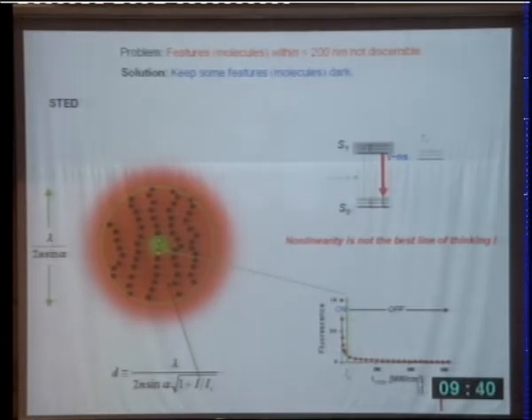If you really want to understand these concepts properly, in all the ramifications, of course, also the power and limitations, what we actually do is we transiently prepare the molecules in two distinct states. That's what we do. That's the only purpose of this beam. Keep it here in the ground state. Do not allow these molecules to assume the S1. Whereas in here, they are, so to speak, forced to assume the S1. So here then S0, here then S1.